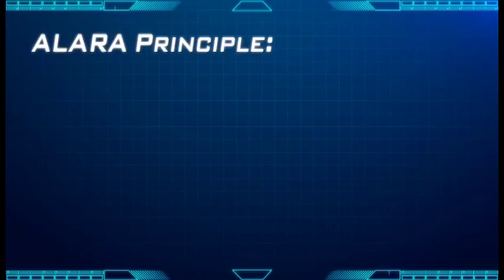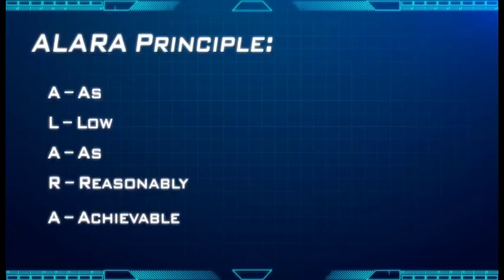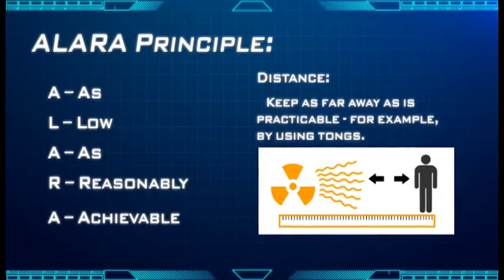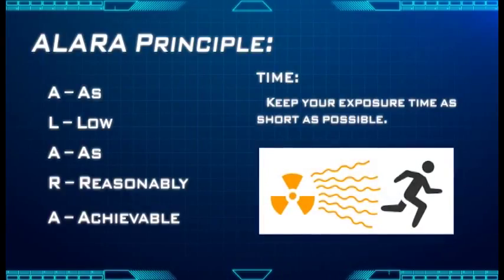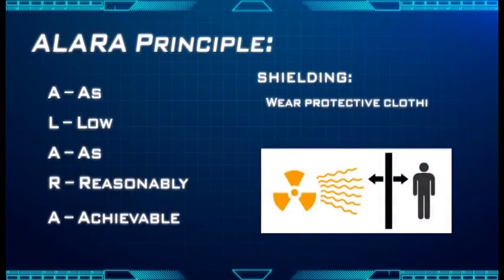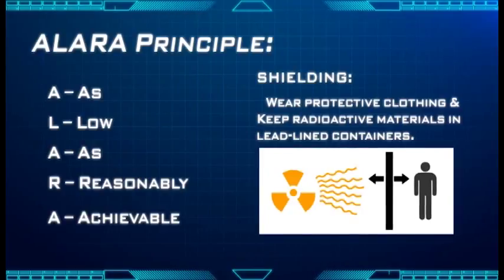Remember the ALARA principle: as low as reasonably achievable. Distance. Keep as far away as is practicable, for example, by using tongs. Time. Keep your exposure time as short as possible. Shielding. Wear protective clothing and keep radioactive materials in lead-lined containers.